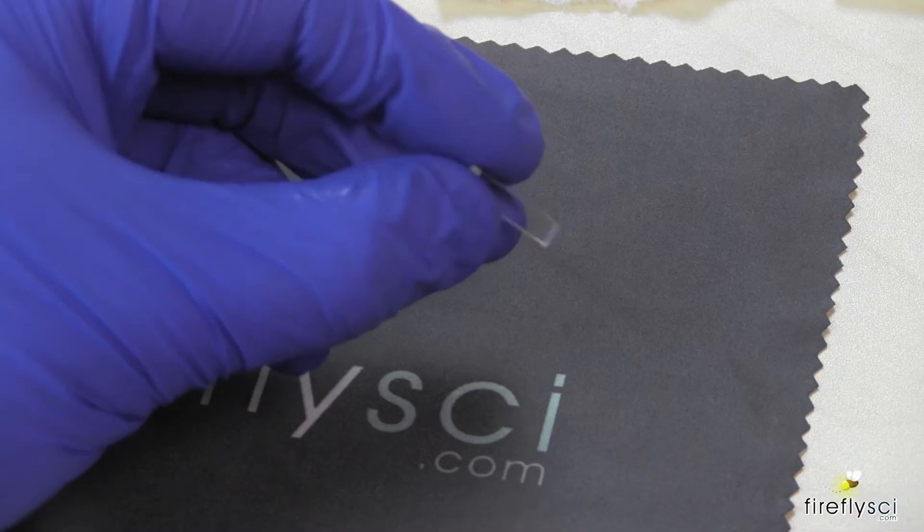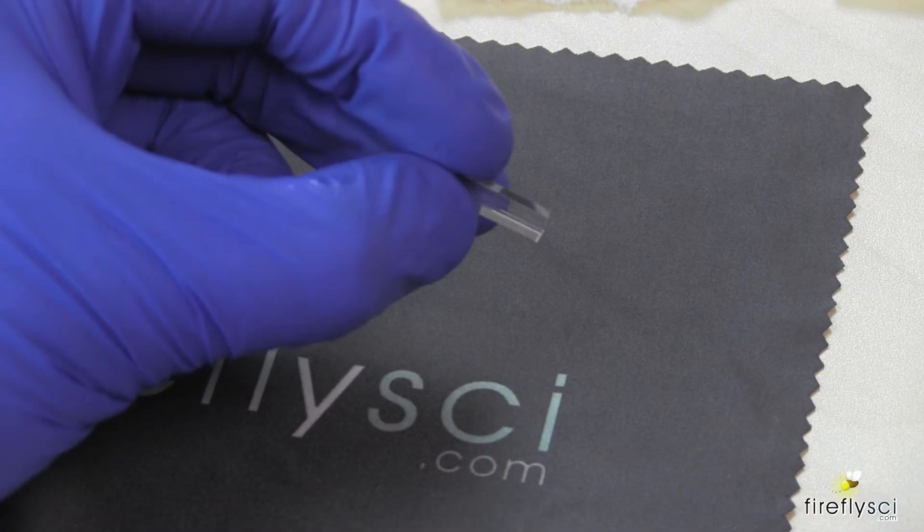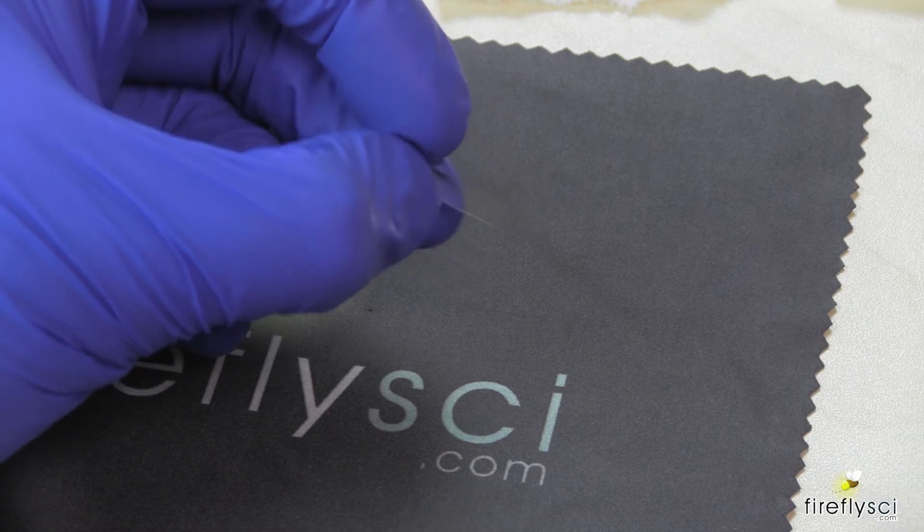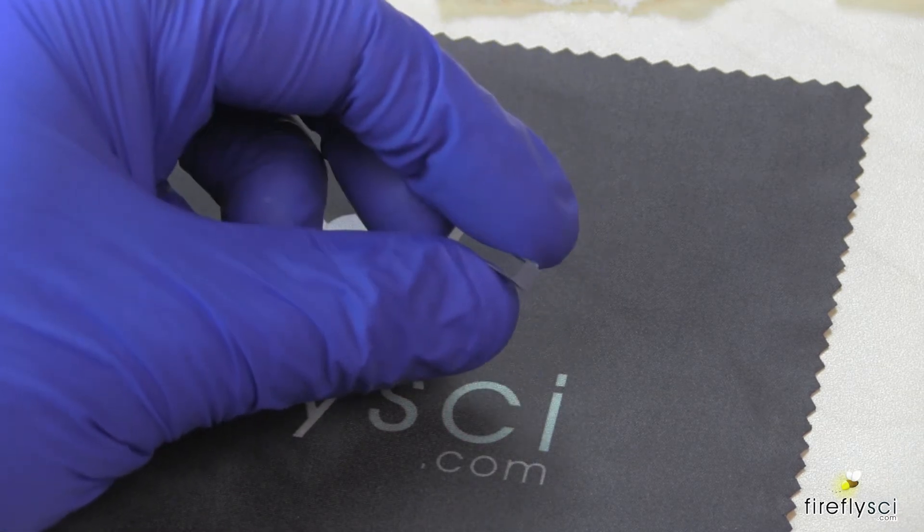How is it made? Even though the cell looks like it is a solid block of quartz with a square hole in it, these flow channel cells are actually made from four pieces of quartz that are fused together.